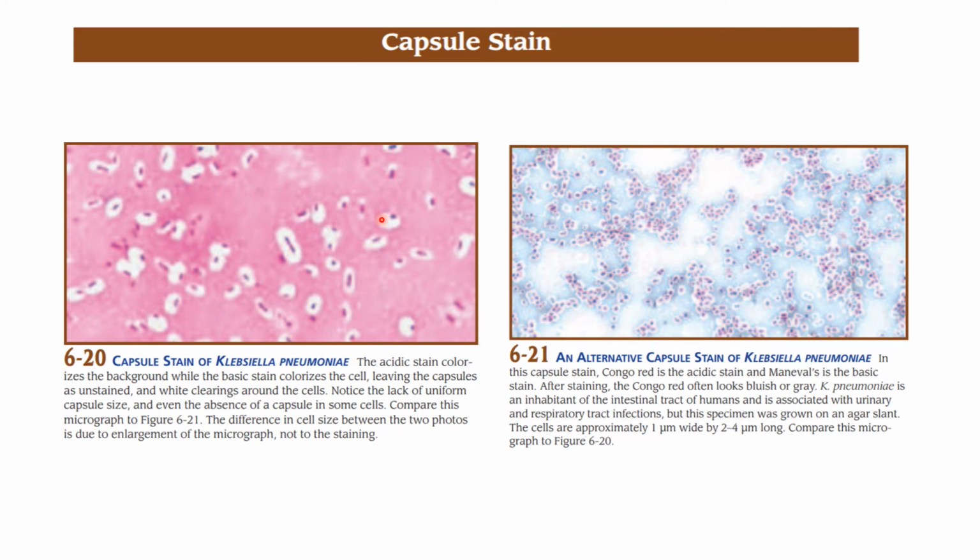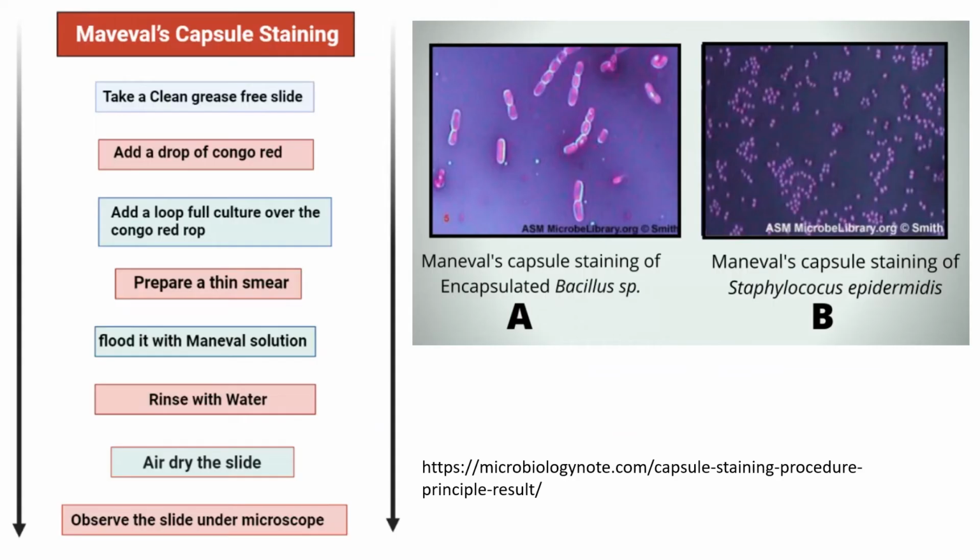So the capsule repels the phagocytosis of macrophages. Okay? So therefore, nahirapan yung macrophages na kainin or iphagocyte yung bacteria with capsule. Okay? Okay.